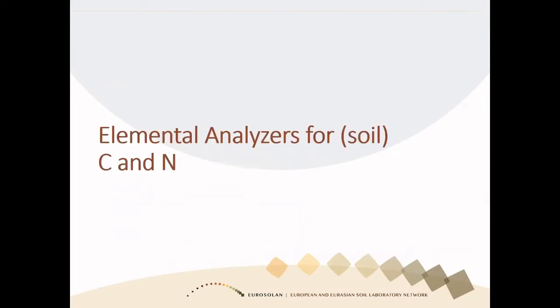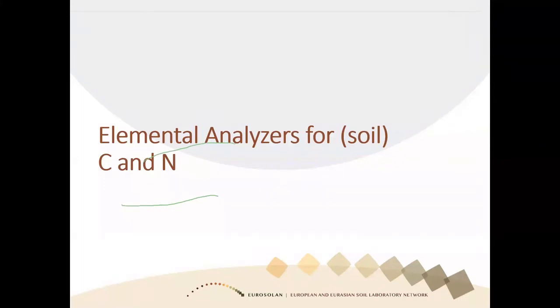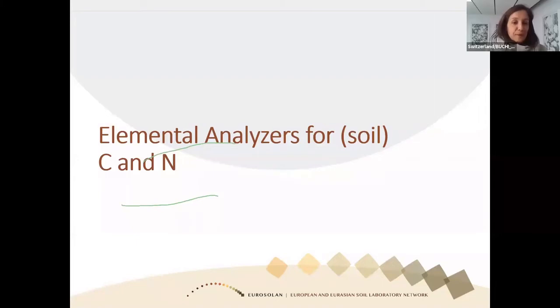So that was a brief description and some suggestions on Kjeldahl analysis. Handing over to Leo to talk about the elemental analyzers for soil and for carbon and nitrogen.